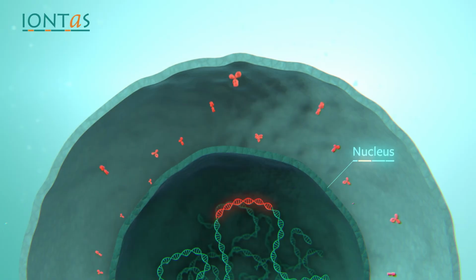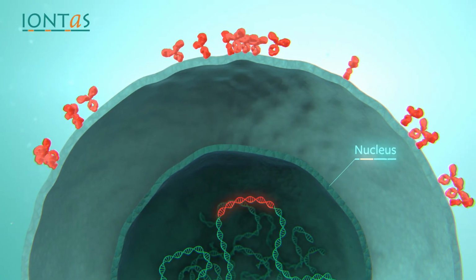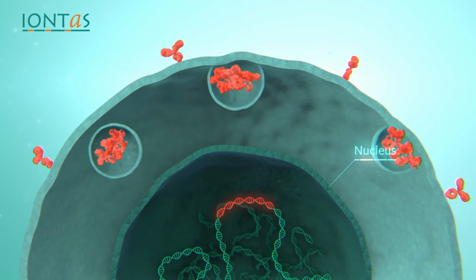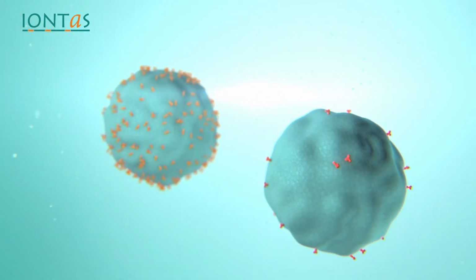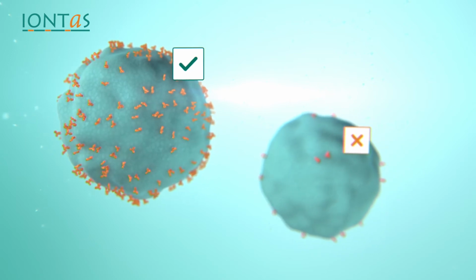If an antibody has poor manufacturing properties, copies come onto the cell surface and potentially aggregate. These aggregates are recycled back into the cell and degraded, resulting in few copies being displayed on the cell surface, whereas developable antibodies show high display.